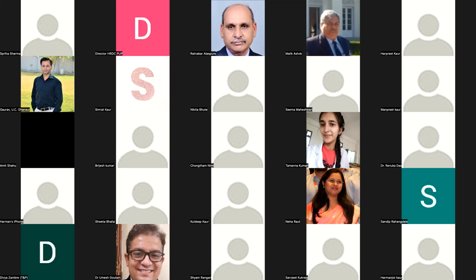Yes, sir. Actually, we have seen bleeding of columns after some time. Yes, that depends on it. If you don't wash it properly and you use a higher pH, then there is always bleeding of the column. There is always a need to maintain the right pH for proper use.